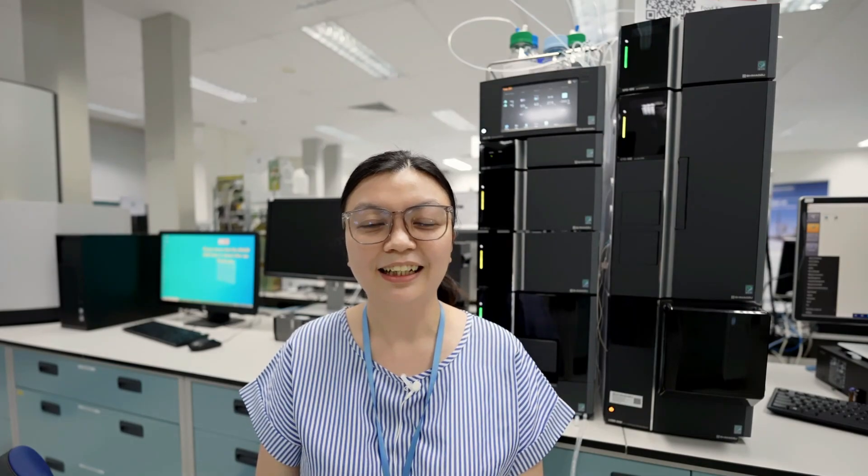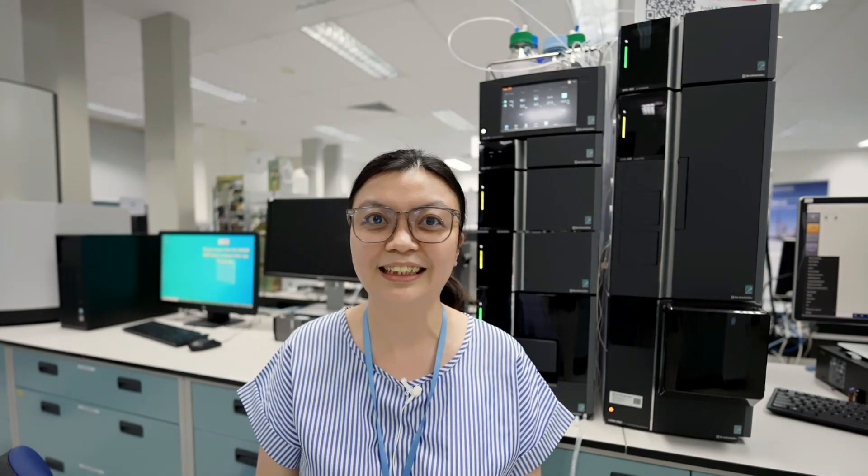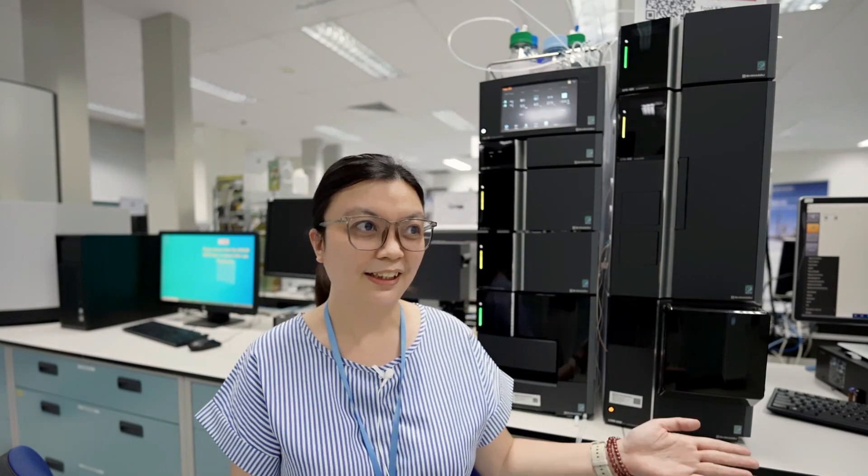Hello, welcome to Shimazu Asia-Pacific YouTube channel. My name is Kit Yee. I'm an LC-MS application chemist. Today, I'm going to show you the easy maintenance of Shimazu New Generation Mass Detector, LC-MS 2050.